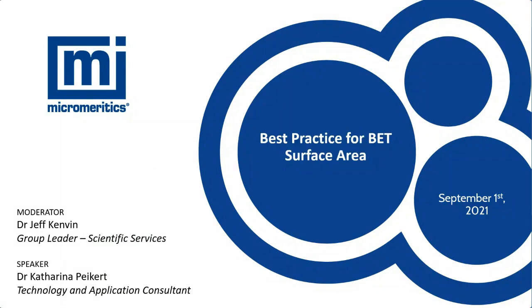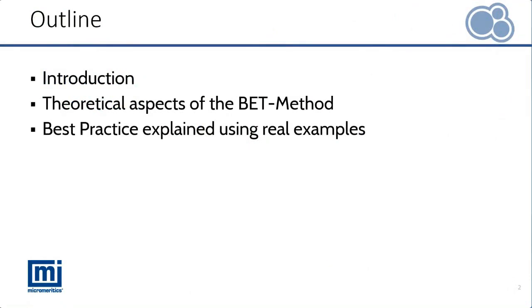Thank you, Jeff, and I welcome everyone to this webinar. Today it's all about the BET method, and I called this presentation Best Practice for BET Surface Area. After a brief introduction, I would like to start with the theoretical foundations of the BET model. The main part of this webinar will use real examples to look at how the BET method can be used in the best way possible.